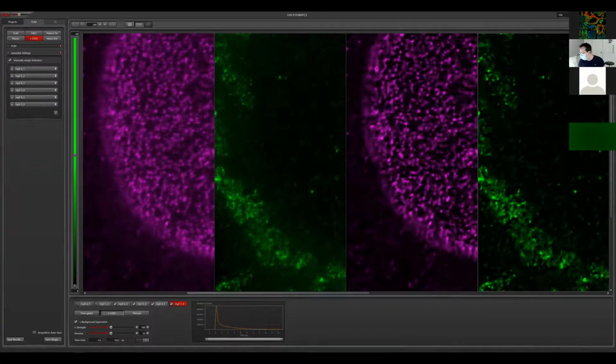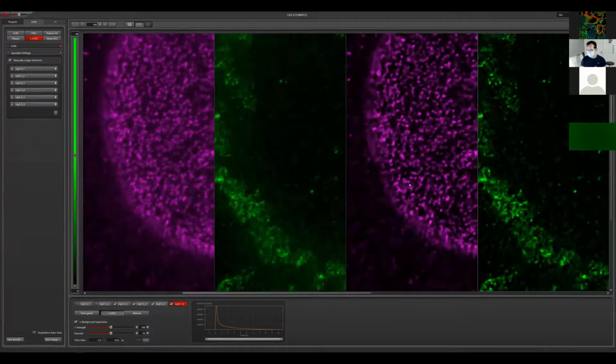Okay, and this is just a two-color label, so very simple, let's say, a slide to separate. Now we will go to something a little bit more exciting. For the people that were in my workshop in the morning, I showed you how you can really easily and nicely separate two dyes in the far red channel just with the lifetime. And the reason why we're doing this test mostly in the far red is because we also want to use these dyes for STED.